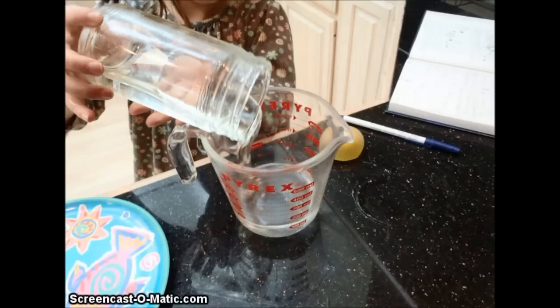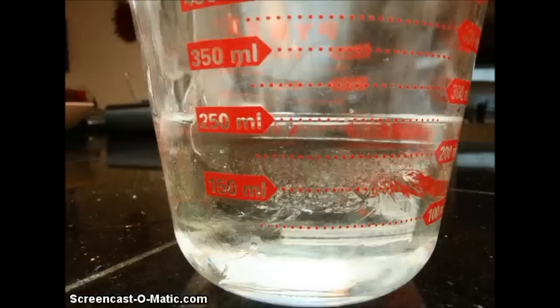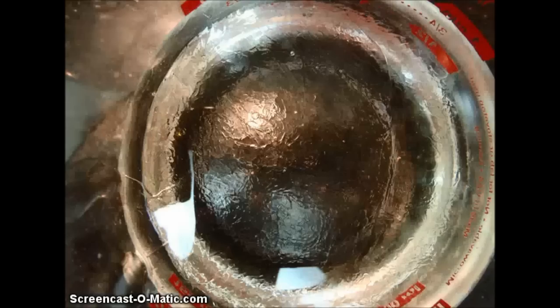Pour out the corn syrup. Notice there appears to be two layers, one thick on the bottom, one thin on the top. What is the explanation? Weird looking.